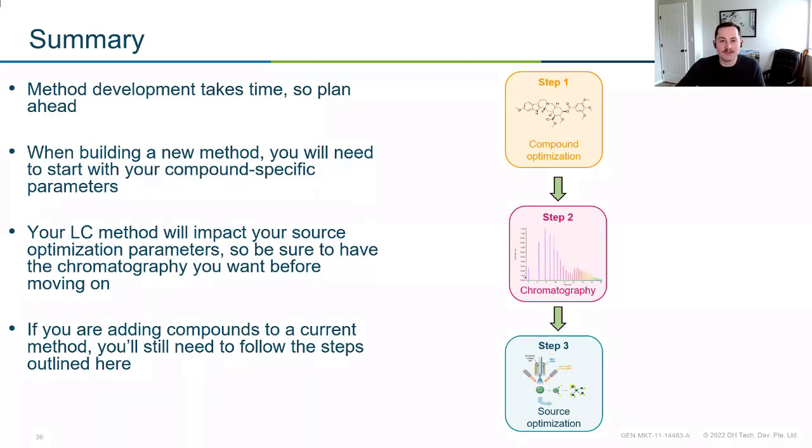And taking notes is also my next biggest push. If you have those 5 fragments, for example, all recorded, in the future, when you go to do your chromatography or inject your first matrix sample and you notice there's a huge interference, you haven't wasted any time. You can just go back to your notebook or your other method and pull a new transition. So take good notes and take your time during these method development stages.